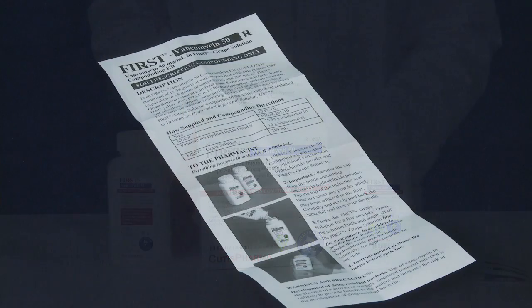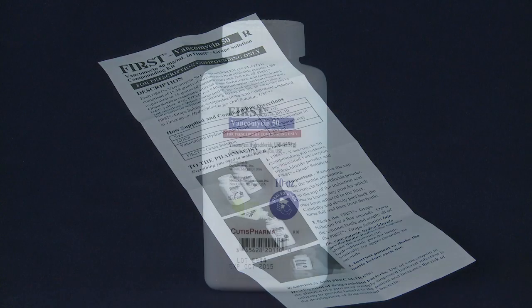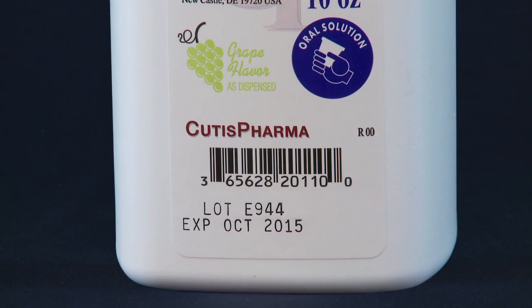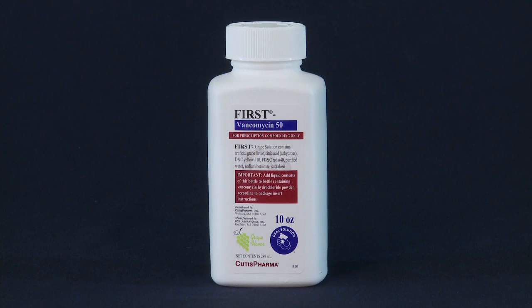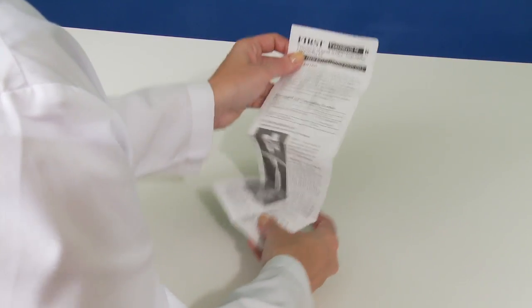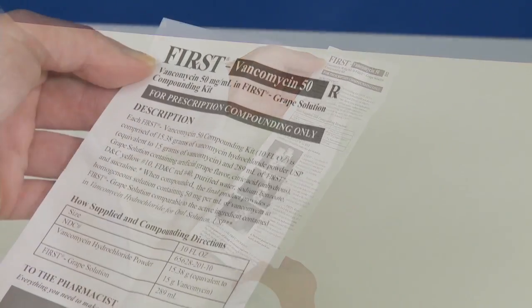You should have the following: the package insert, a bottle of pre-weighed vancomycin hydrochloride powder with a bar-coded label. Note that this is the bottle you will dispense to the patient, and a same-size bottle of FIRST grape-flavored solution. Take a moment to review the package insert to familiarize yourself with the procedure.